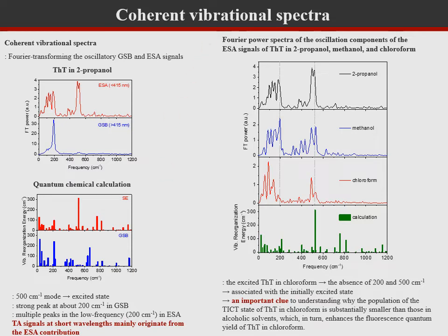We also measured the ESA signals of ThT in methanol and chloroform and obtained the Fourier power spectra of the oscillation components. The coherent vibration spectrum of the excited ThT in methanol is quite similar to that in propanol. In contrast, the coherent vibration spectrum of the excited ThT in chloroform shows distinctively different features, which are the absence of the 200 and 520 wavenumber peaks in the coherent vibration spectrum of ThT in chloroform.